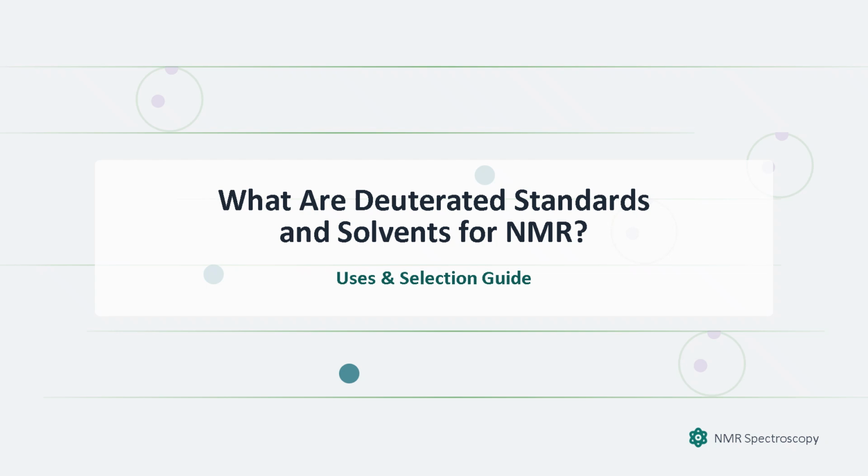In this video, we'll explore what they are, why they are absolutely critical for NMR experiments, and how to choose the right solvent or standard for your specific application. These are concepts that every NMR user encounters, but not everyone truly understands.